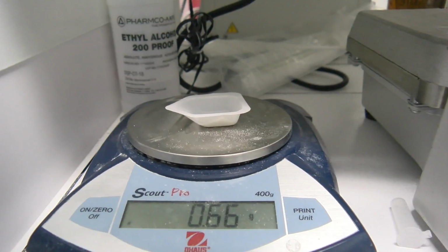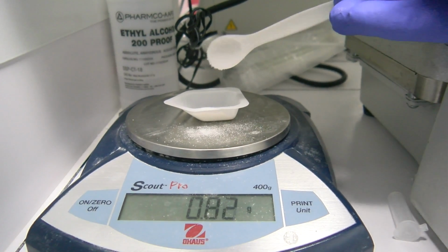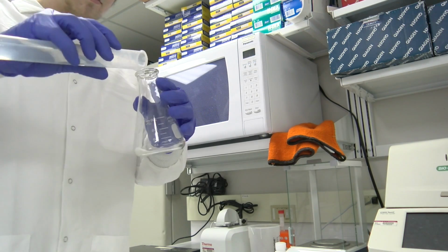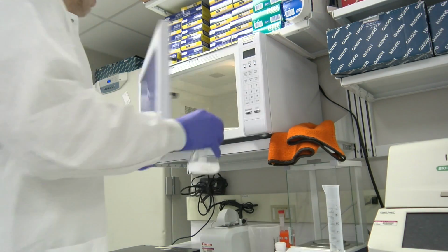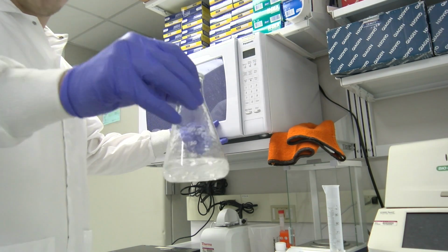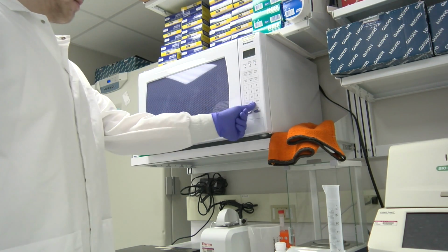For this 2% gel, we'll need 1 gram of agarose and 50 milliliters of TAE 1X buffer. Next, you must add the agarose and the TAE together in a flask, and then put it in the microwave for 40 seconds, swirl it, and then put it in for another 10 seconds, or until you can no longer see the crystals in the solution.